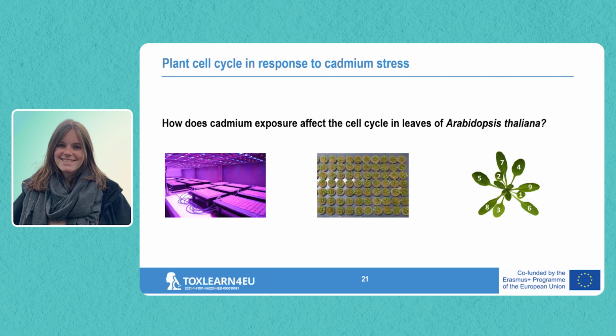And then here on top of this box, we have these tubes filled with sand, and that's where our plants are growing. Their roots grow into the box with the nutrient solution and take up nutrients in this way. And when we want to expose them to cadmium, for example, we simply add cadmium to the solution in our box.